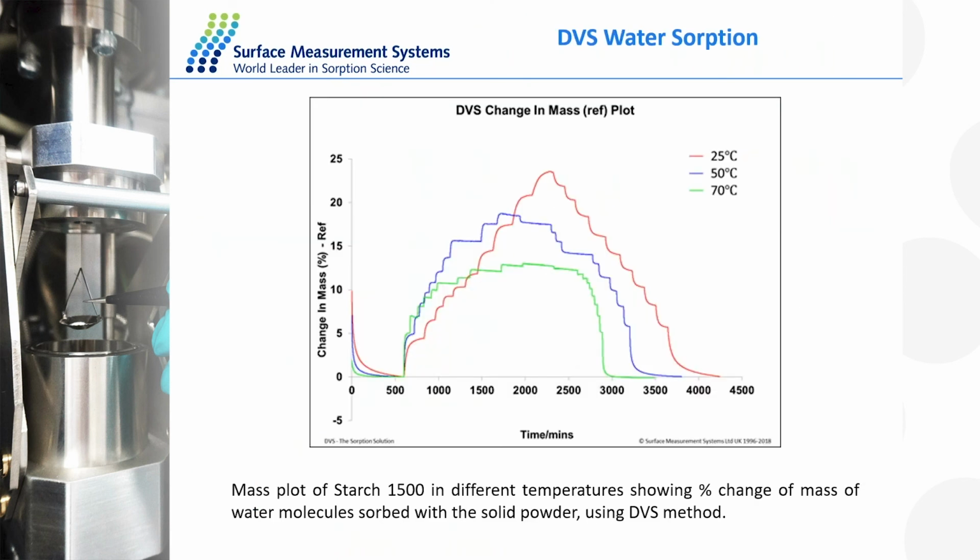That was actually the question I was asking, and I'm sorry I missed it during the presentation. It's the impact of temperature on the isotherm. So you run it here at 3 different temperatures, and my question was in the 25C to 40C range, which is typical in the pharmaceutical industry, how much of an impact on the isotherm are we going to see? It wasn't necessarily about the glass transition, but the change in the mass of water that's absorbed as a function of temperature.